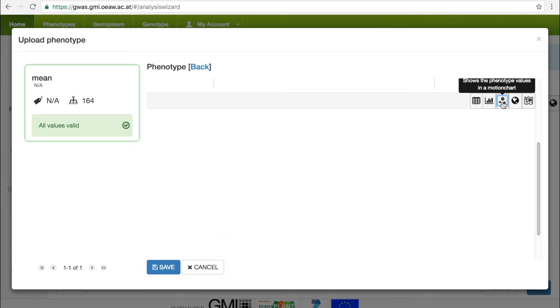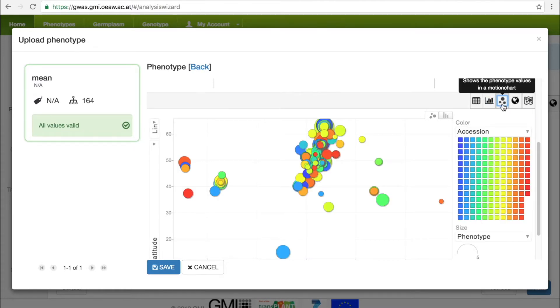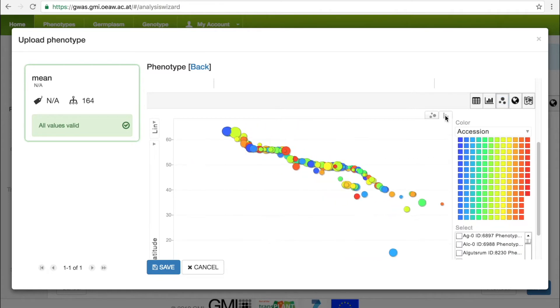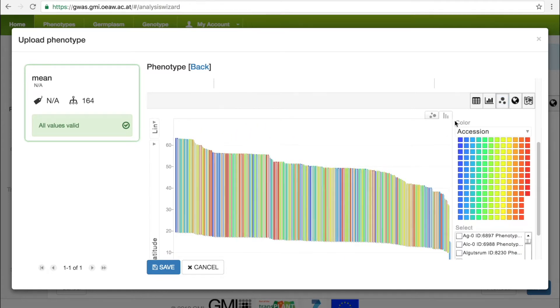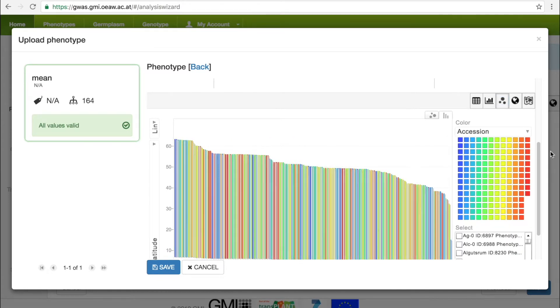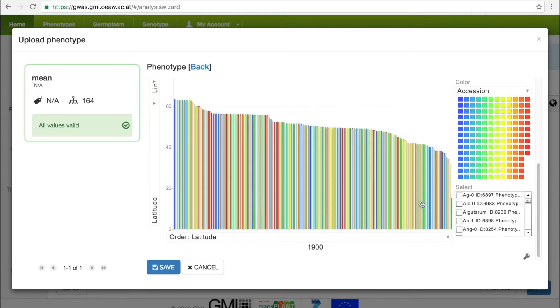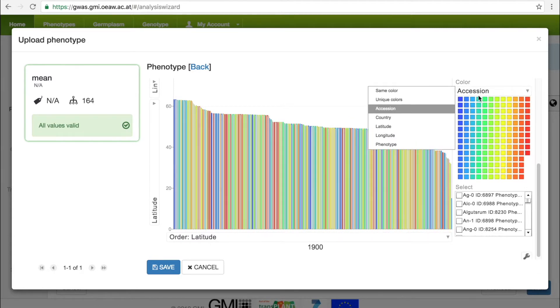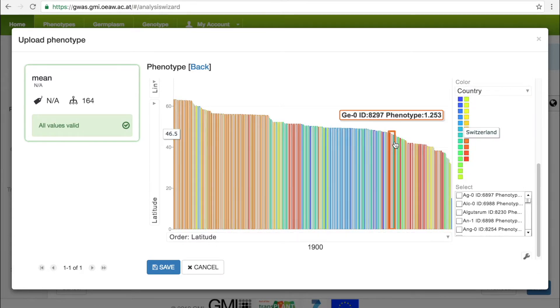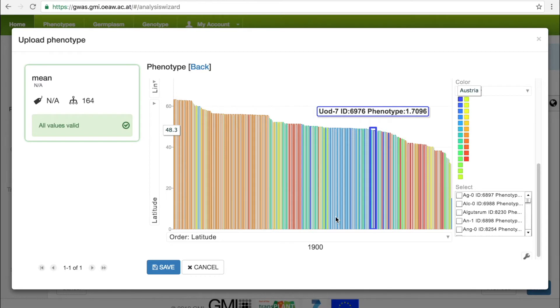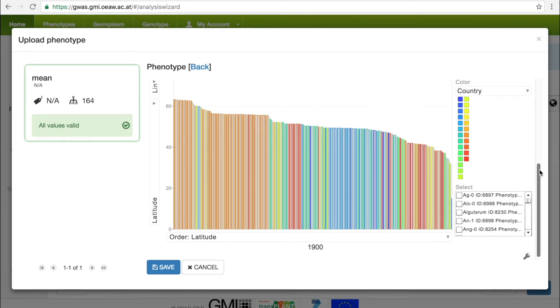We can visualize the data as a scatter plot or motion chart, where each bar or dot represents a single accession. The accessions can be color-coded based on the meta-information, and the axis can be sorted, for example, by latitude and longitude. This can allow the user to discover interesting geographic patterns in the data.